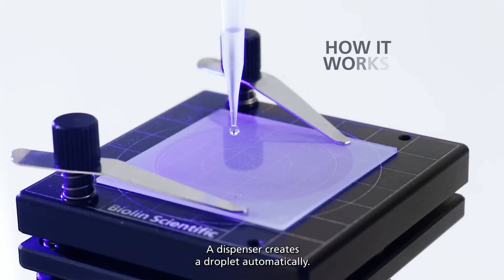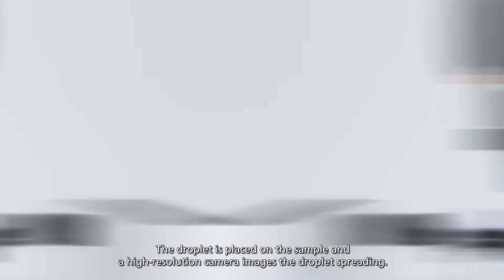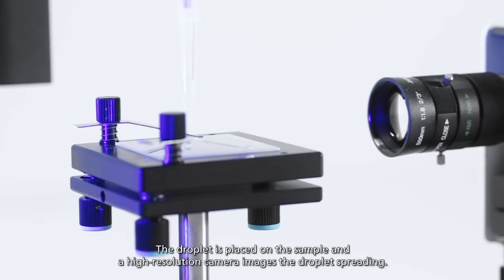A dispenser creates a droplet automatically. The droplet is placed on the sample and a high resolution camera images the droplet spreading.